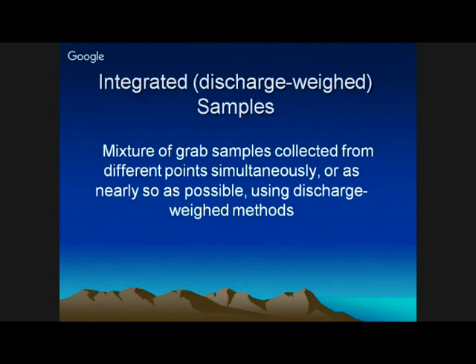Next is the integrated samples. Mixture of grab samples collected from different points simultaneously, as I have already explained, or as nearly so as possible, using discharge weight methods.